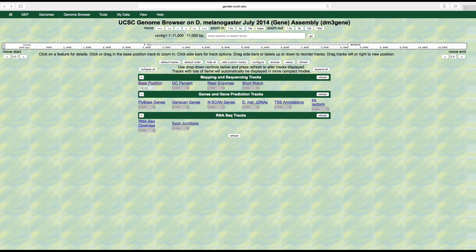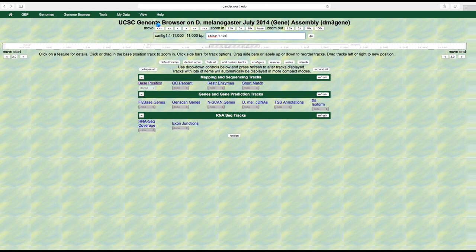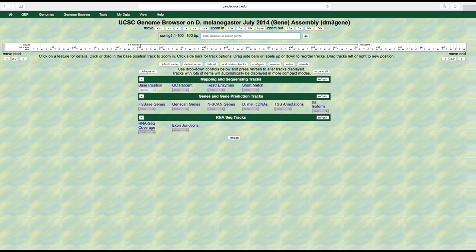Let's go back to the browser by clicking the back button and view this track. Right now the base position is set at dense. We can't see the individual bases because we are too zoomed out. Let's zoom in to the first 100 base pairs of this genomic sequence by typing contig 1 colon 1 through 100 into the position slash search box.